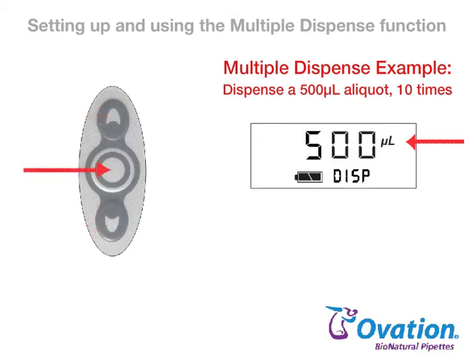Press and release the center button to lock in this new volume setting and advance to the current count setting. The count setting will either be the last number of dispenses used or the maximum number of full dispenses that can be performed at the new volume setting.